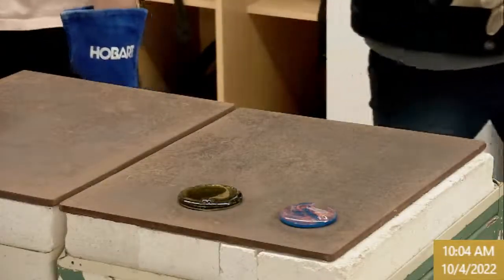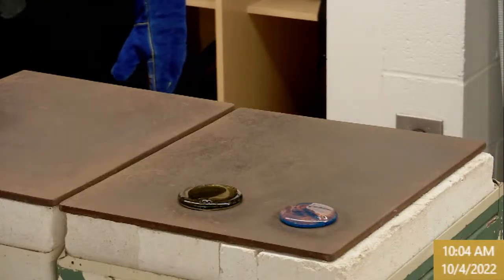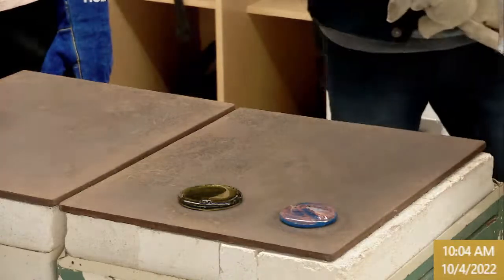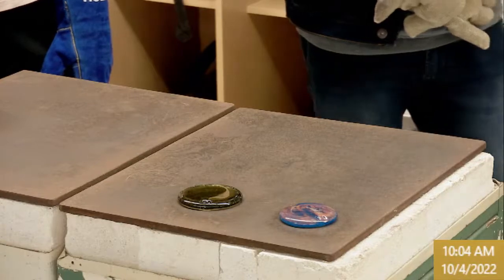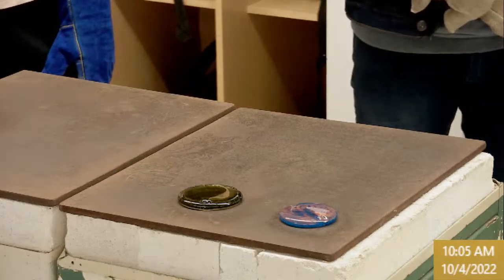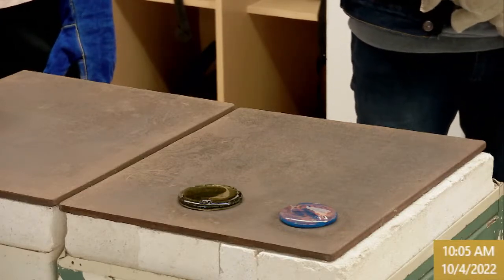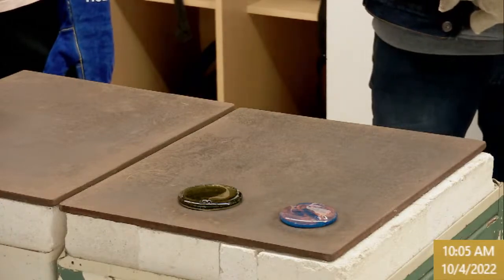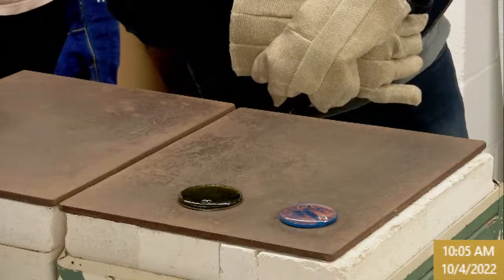All right, so next up is C2. And that cobalt, it's not looking terribly blue at the moment. It's looking more... Yeah, so I'm wondering if the iron from that sand and the low cobalt, because that's not the typical iron color and it's not the typical cobalt color, I think we're piggybacking the native impurity of the iron plus cobalt. That's actually kind of unexpected.